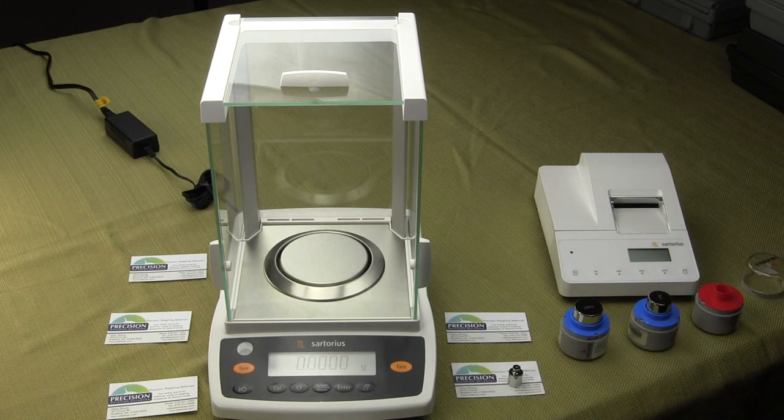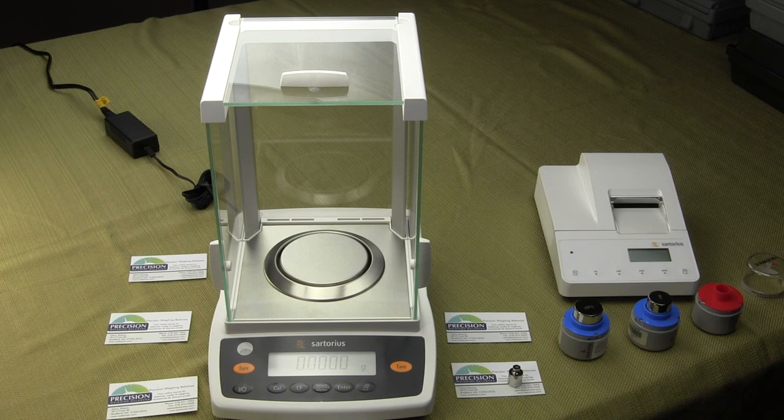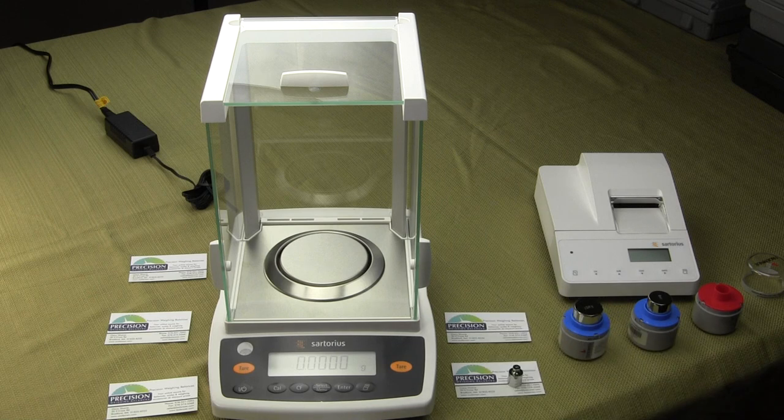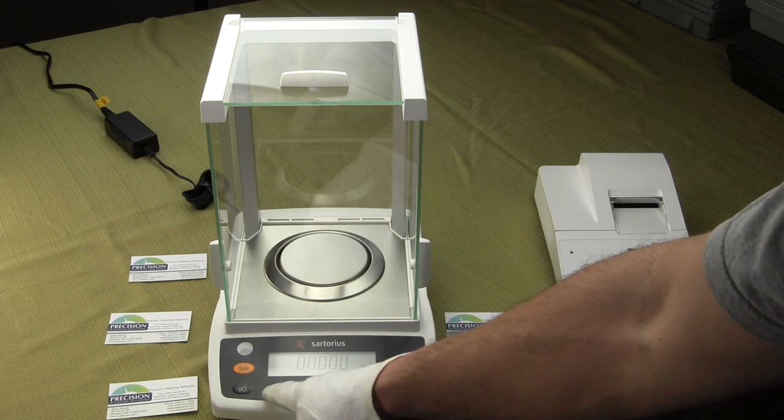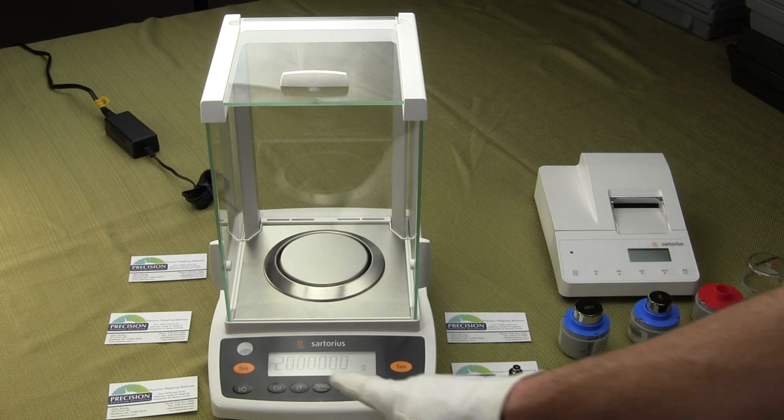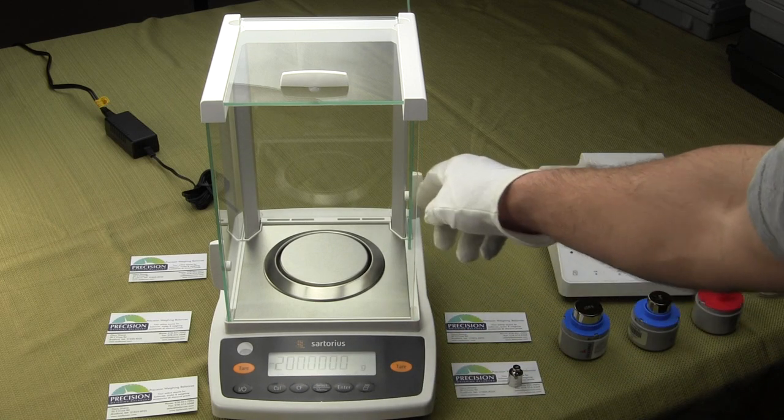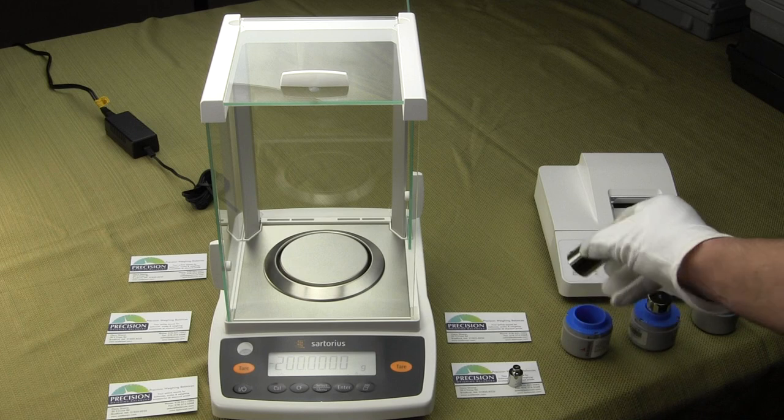This balance has been on for at least an hour. You always want to have your balance on for a minimum of an hour before doing a calibration. The balance also has to be level. To perform calibration, simply press the CAL button. You'll notice the display says external CAL and then it flashes to 200 gram weight. You need a 200 gram class 1 weight, which I have here.